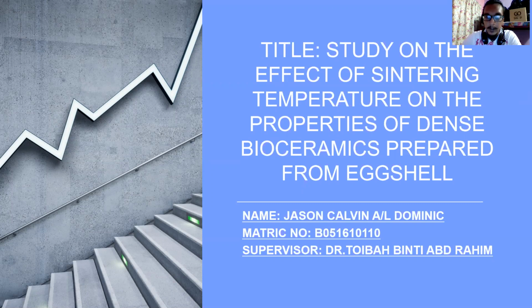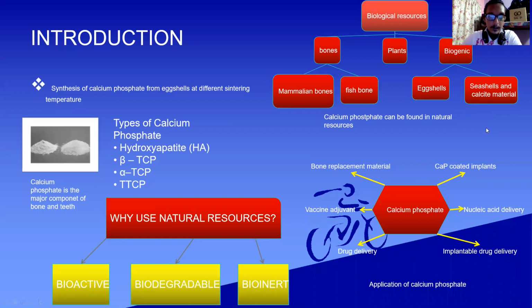I'm going to start off with my title, which is Study on the Effect of Sintering Temperature on the Properties of Dense Bioceramic Prepared from Eggshells. Okay, so the introduction.